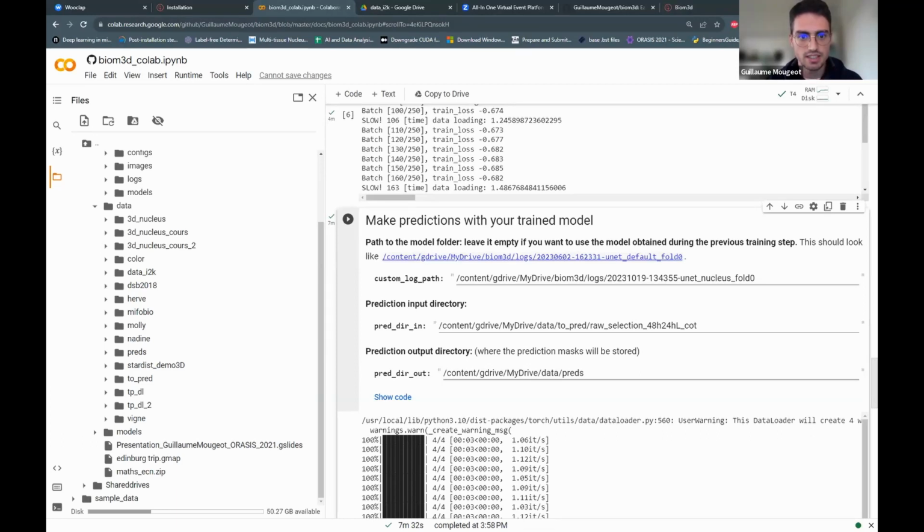Yes, Alex, it works with DICOM images. I have not tested it, because I'm using a package called SimpleITK, and normally it detects the format of the image automatically. I think I've read in their documentation that they work with DICOM, but test it, and if you find that it doesn't work, just email me. I've tested, for example, NIfTI format a lot, and it worked really well, but DICOM should work too.